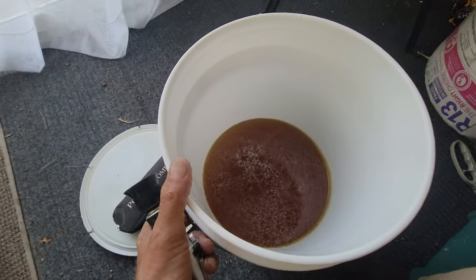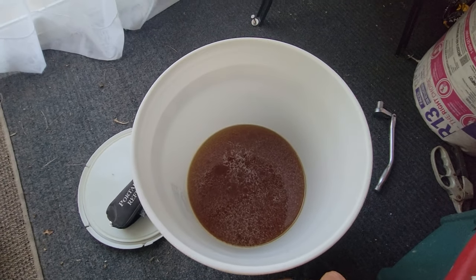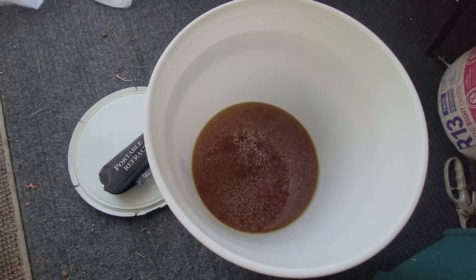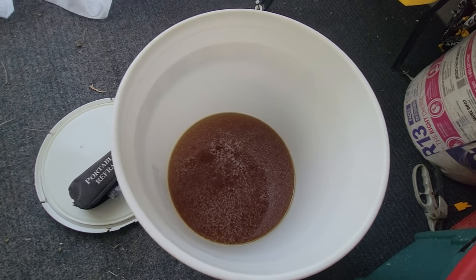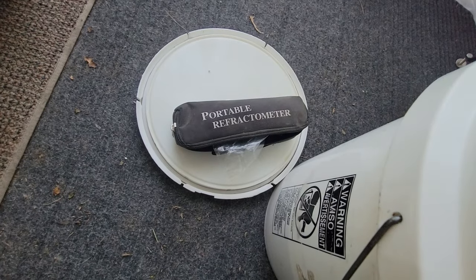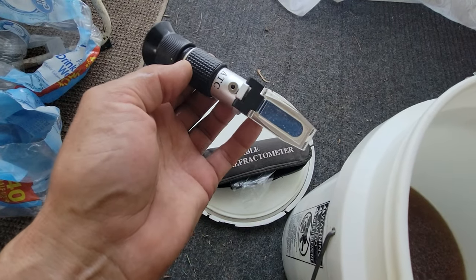Before you bottle your honey, it's very important that you make sure that the moisture content in the honey is low. And ideally, you would want to see it around 17%. 18%, in my opinion, is slightly high. So we're going to check it with my portable refractometer, which looks a little something like this here.